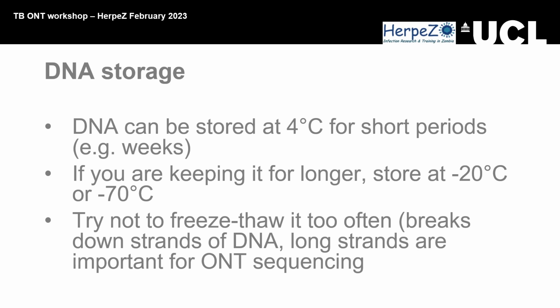Then there was another question with regards to the original CTAB protocol. How do you dry your pellet? You just open the lid and expose it? So we open the lid, then we dry it on the heating block, but I did 3 batches. The first batch I did on the heating block, the second one was in the hood. I think the ones that were on the heating block did well. So you just open them up and leave them to dry off.